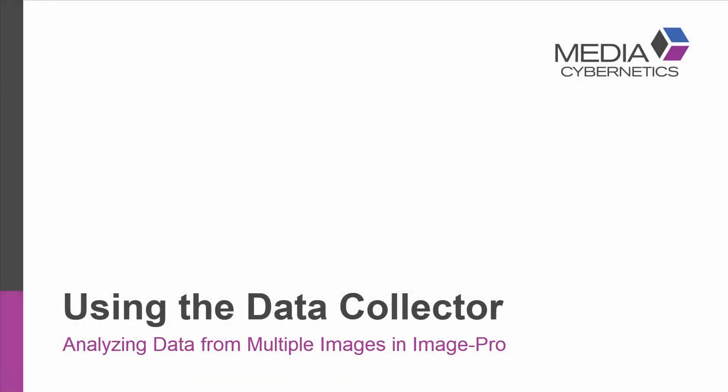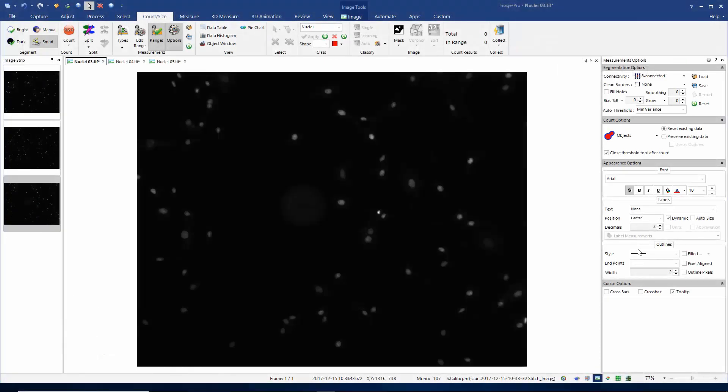Hello, today we'll be discussing how to use the data collector in ImagePro. The data collector allows you to collect data from multiple images into a single table, and it gives you the option of collecting raw data, statistical data, or both raw and statistical data. This video assumes that you already know how to use the count size feature of the software. If you're not familiar with this, I suggest you go and watch our count size video for some background information.